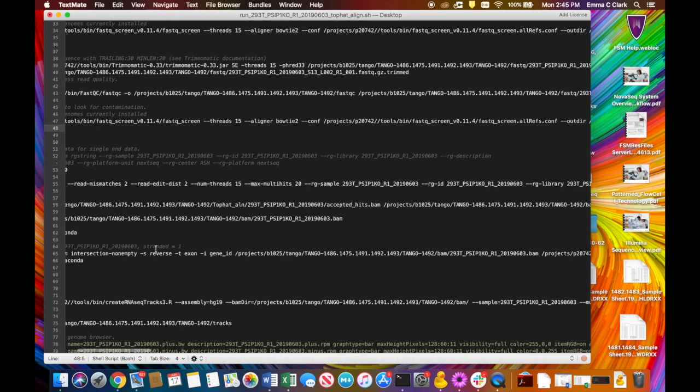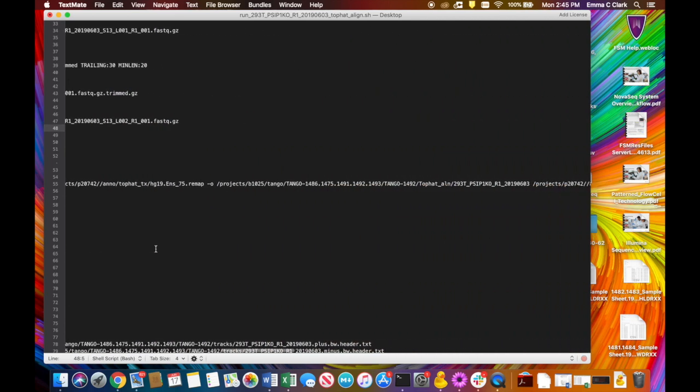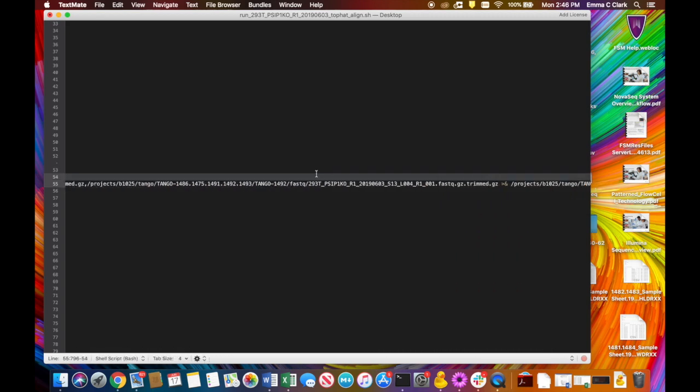And then we're going to go all the way over, because this is the line here, the TopHat information. This is the call for all the information that TopHat needs to run, and it doesn't like not having files present, so it will just stop and get angry. So you've got to remove lane 3 and lane 4. We have lane 1 and lane 2, so just go over, it's kind of tedious, but scroll on over till you get to the little caret, and then you just delete.